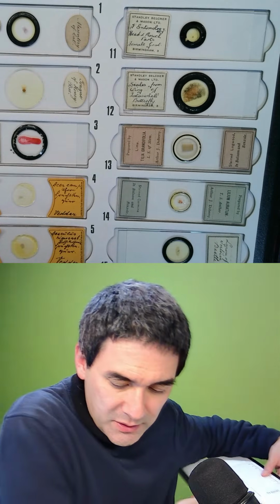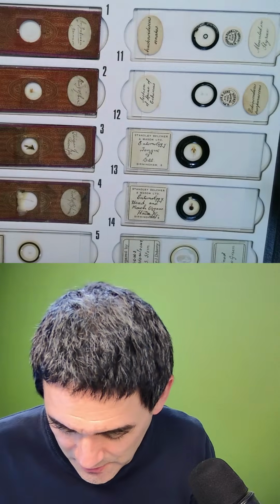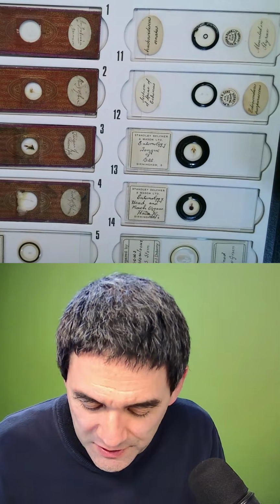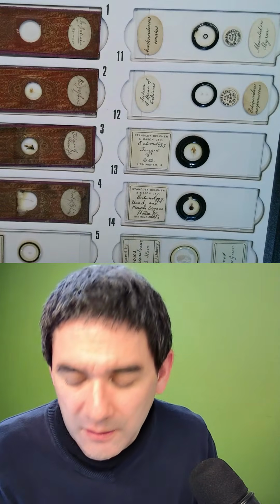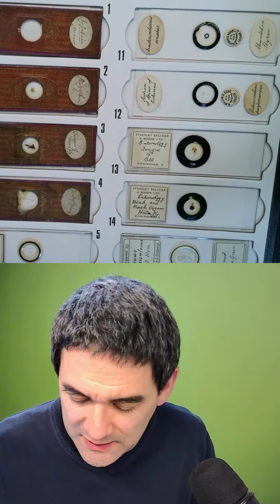Let me put this one here carefully over it. And look, there are some red paper covered ones here as well. Of course, I don't know. Generally I don't like to touch them anyway. I only touch them on the side, also because of the fingerprints and so on. But of course, you never know what they've included in those, maybe simply to make them longer lasting. But honestly, these are antique slides here.